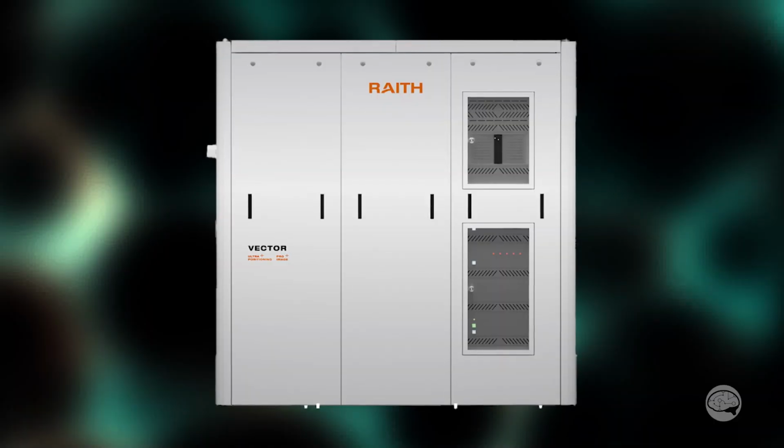It sounds absolutely fascinating. I was hoping you could tell us about it. What is the Vector? What does it do? Sure. Thanks, Eric. The Vector is an automated SEM. It fits somewhere in between a conventional analytical SEM and a CD-SEM, like you would see in a fab.